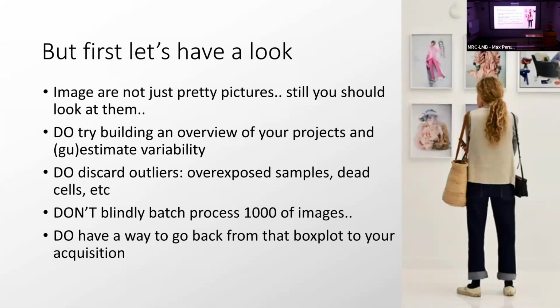It happened sometimes to me that we went straight to analyze with a very complicated and sophisticated workflow. And at the end, we had to go back and try to build an overview picture and try to understand what's going on. Why don't I get the result? Actually, my pictures were crap from the beginning. I never looked at them, and it would never have worked. So that's an important step. Just try to skim through your data at least once.